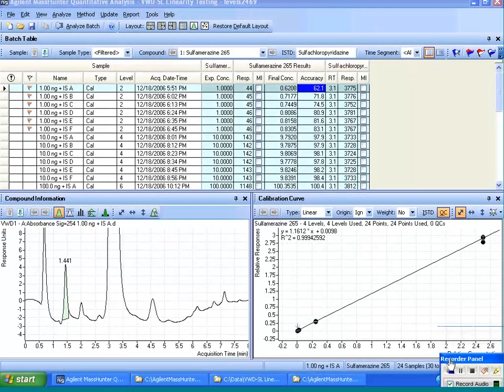Limit of quantitation is the situation in method development when you need to provide a precision for that method. Typically that involves estimating the lowest level calibration point and preparing a set of standards and injecting those, let's say, 10 times, and then calculating some statistic like standard deviation.